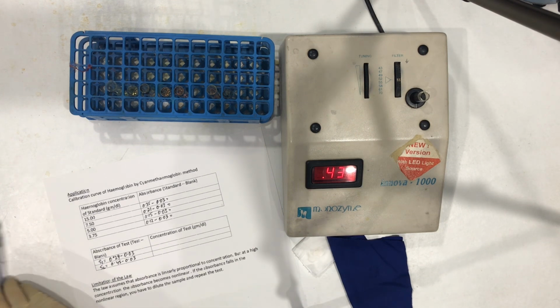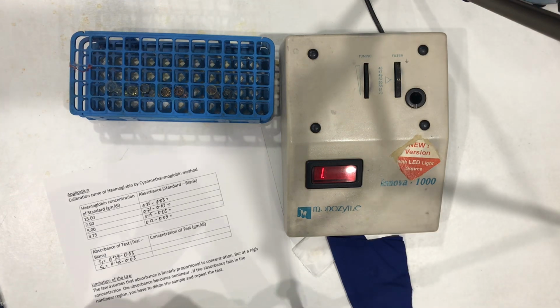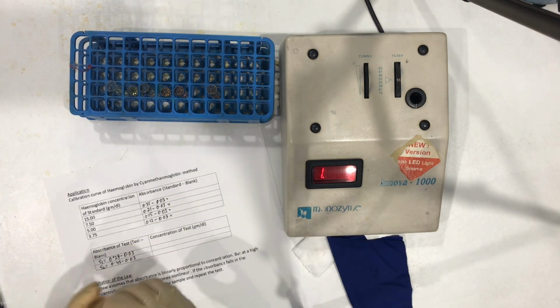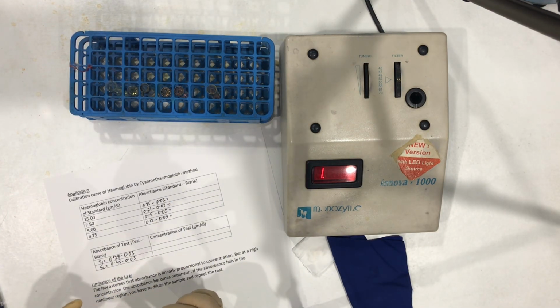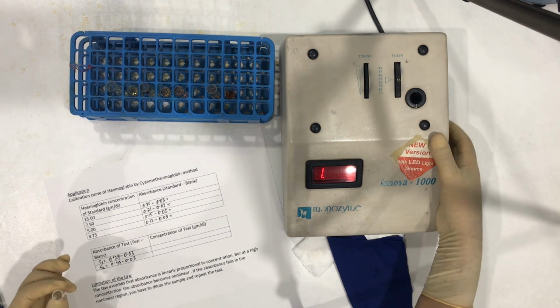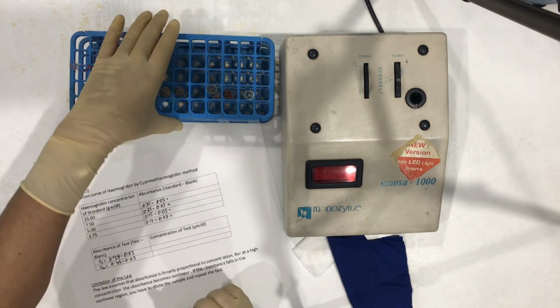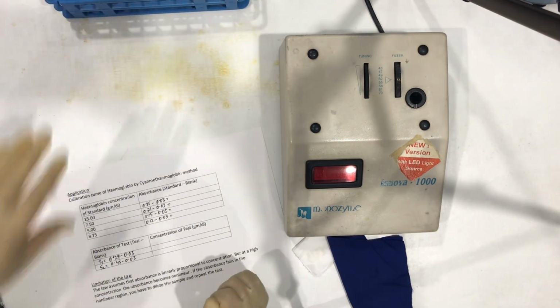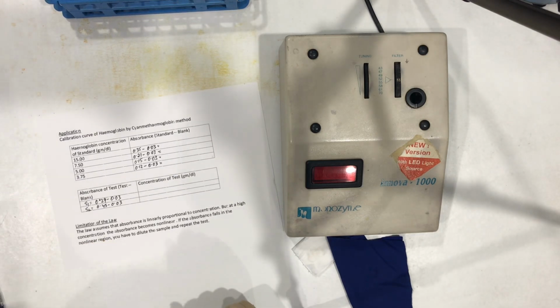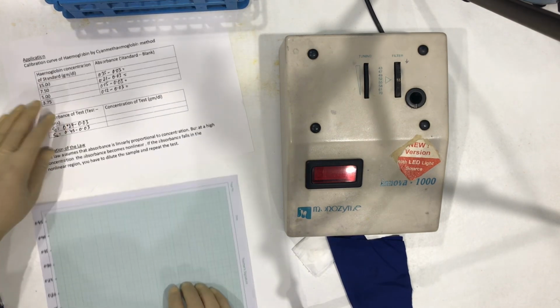Now let us plot a graph. Now we are going to plot a graph of absorbance and concentration.